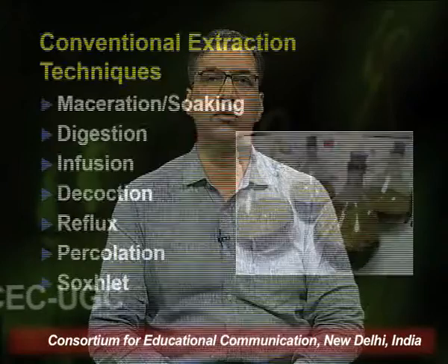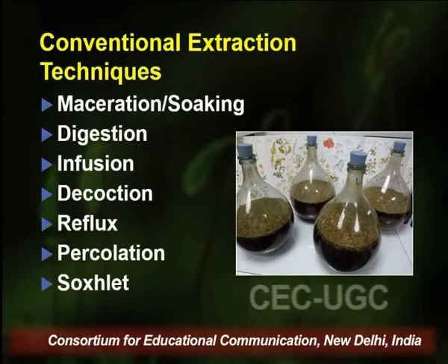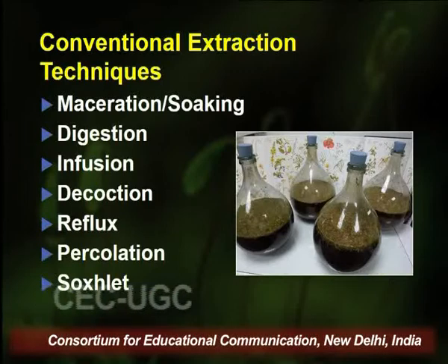So friends, in continuation with the lecture series, today I am going to start with the conventional techniques that are used for extraction. These conventional techniques include maceration, which is sometimes also known as soaking, then digestion, infusion, decoction, reflux, percolation, and Soxhlet. Now, why do we call them conventional extraction techniques?